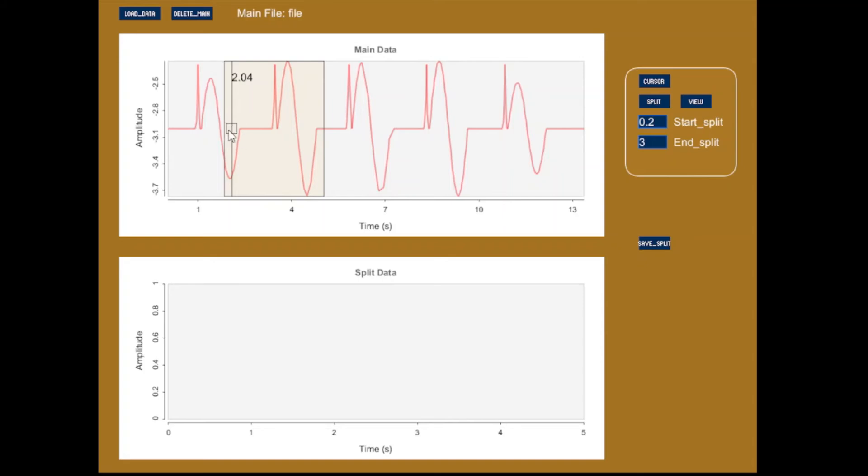We have this yellow box that we can move back and forth. In order to move it, you have to have your cursor inside that small box, and you just move it wherever you want it. What I want to do is line this up so that cursor lines up with the start of my data. The start of my data is a little off from the center, from the edge of the yellow box, and that's how far it's over is determined by this number in this text box. It says 0.2 seconds to the left of the cursor.